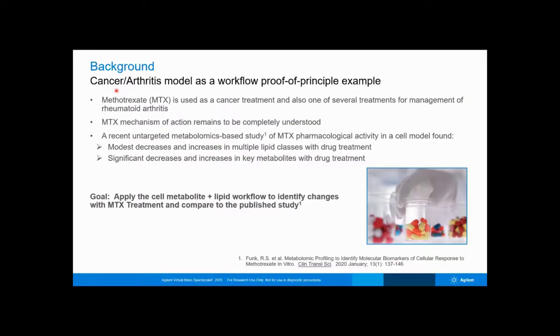To demonstrate our comprehensive end-to-end workflow, we used a well-known and well-studied cancer arthritis model wherein the K562 leukemia cancer cell line is treated with methotrexate, a drug used both as a cancer and arthritis therapeutic. Although well-studied, the mechanism of action for methotrexate is still incompletely understood.